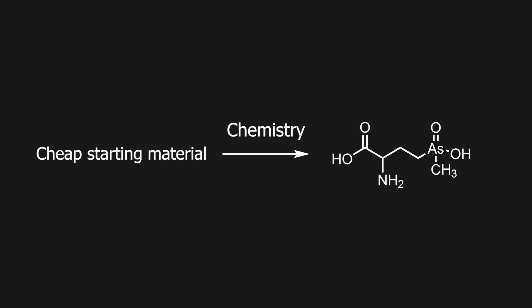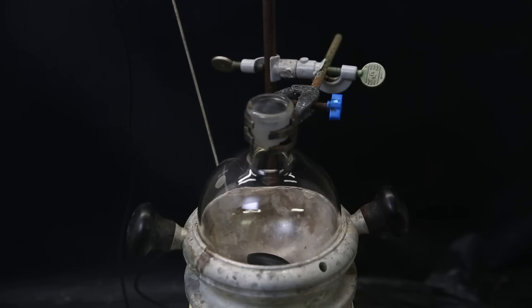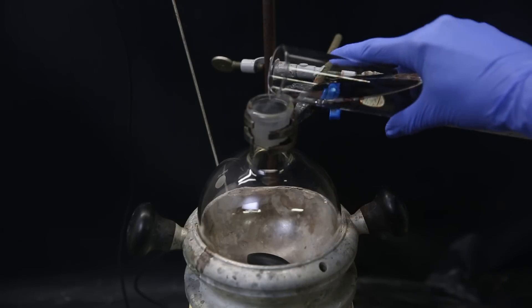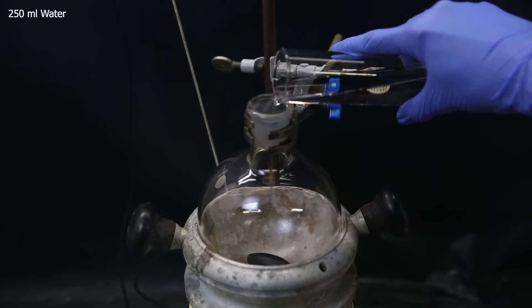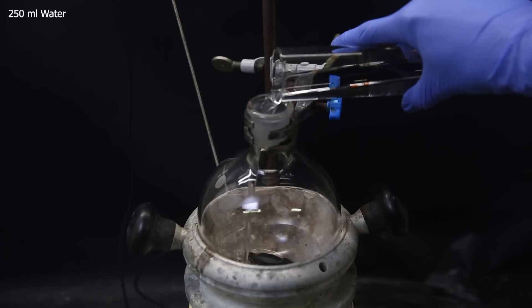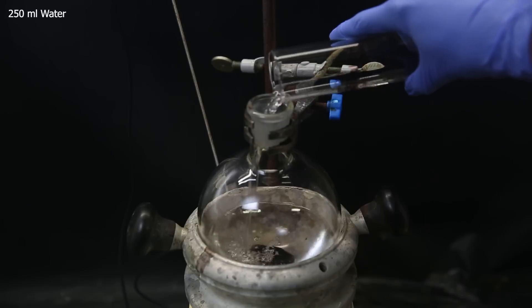There have been a few studies that produced arsenothricin synthetically, and in this video I will repeat one of those methods and see if it has any antibiotic properties. To get started, I set up a flask with a stir bar in a heating block, and add in 250 ml of water as a solvent.